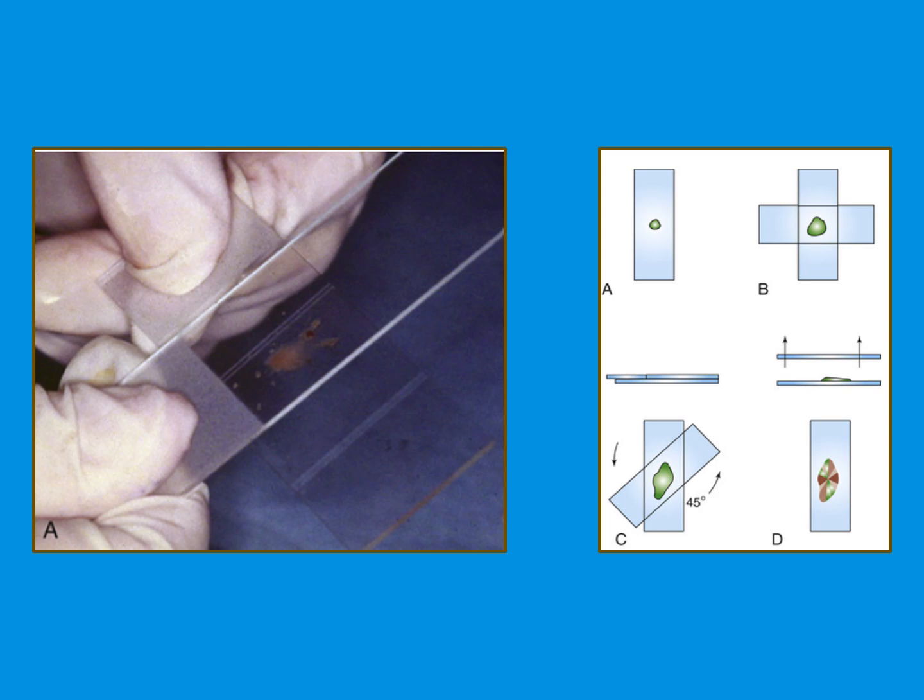And there are several modifications of the compression prep that have less tendency to rupture cells. One of them is to lay the second slide over the aspirate and rotate it to about 45 degrees, which you're looking at in C, and then lift it upward. Another technique that's mentioned in your book is a combination technique of the two.